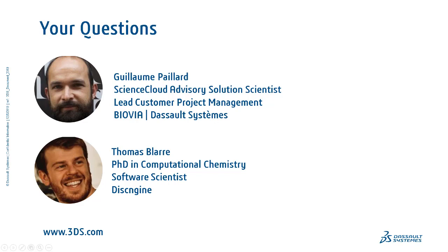Excellent. And it looks like the final question that we have received: how are invalidated samples managed? Is there a list generated which shows what needs to be retested in the analytics? The short answer is yes. All those decisions are captured and can be reviewed. Now, how to address them, I don't know about some out-of-the-box workflow to do that. Is that something that would be possible, Thomas? Yes. Well, I have the same answer as you. The short answer is yes.